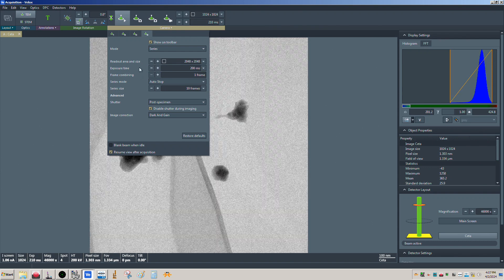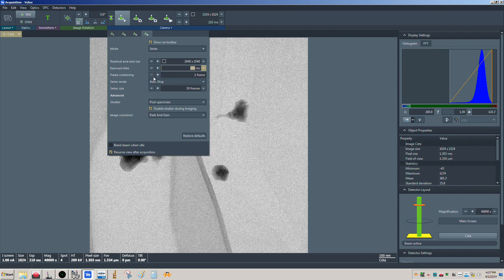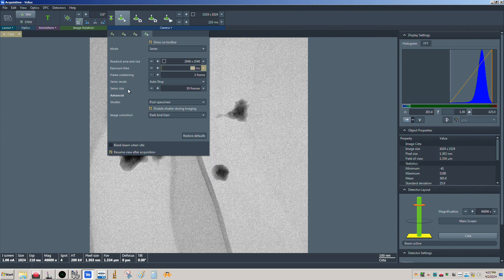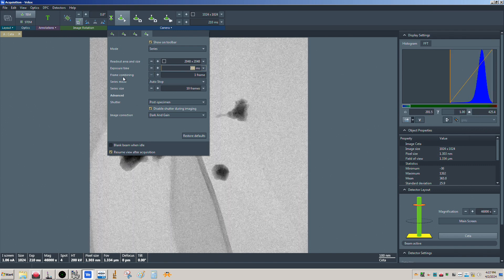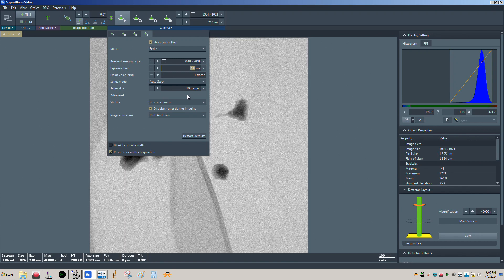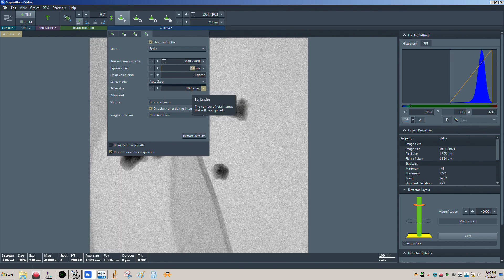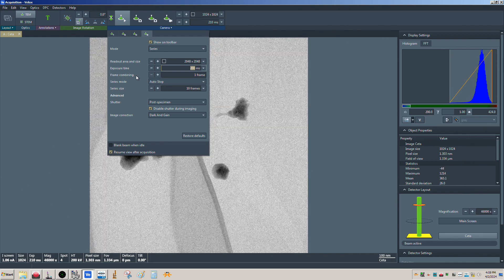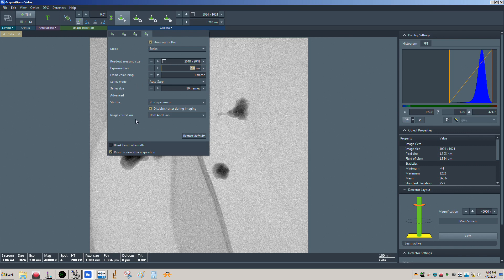Unlike STEM mode, because we're in TEM mode now we're collecting each pixel in parallel, so we're doing an exposure time of 200 milliseconds for the whole frame. You want to keep this short — I like to use 200 milliseconds, you could go down to 100, but I wouldn't go lower than that. You want to make sure you're getting decent signal in the image, otherwise you're basically summing up noise. The series size — 10 is usually a good number. So with 200 milliseconds per frame and 10 frames, that gives you roughly the equivalent signal of a 2-second exposure.